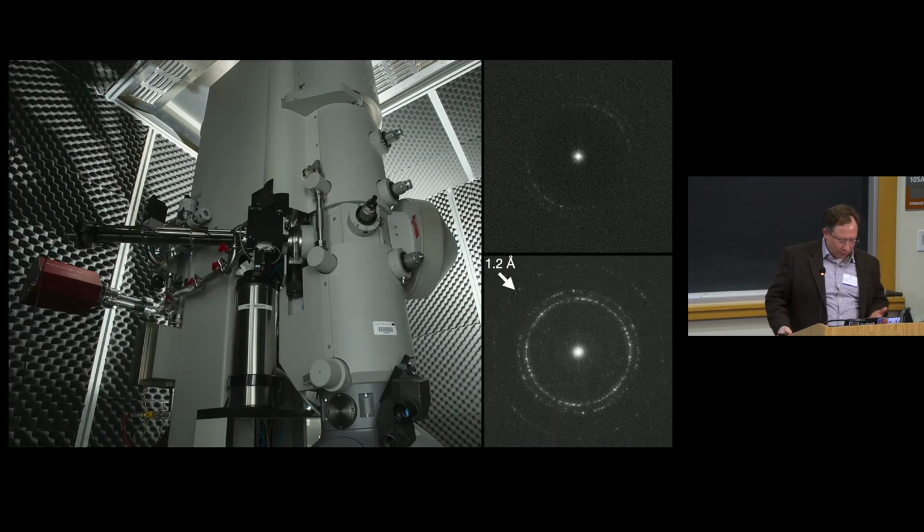And to do this, we had to take an old microscope because they're not making modern helium microscopes anymore, although that's recently changed. And this is a Polara, which is almost 20 years old now. We bought it new at the LMB. And we had to get it back up and running into a reasonable level of performance. It turns out it is quite a good microscope once you put it in a nice box and you fix all the problems, and you can go from something that looks like this, which is where we started, to something that looks like this.